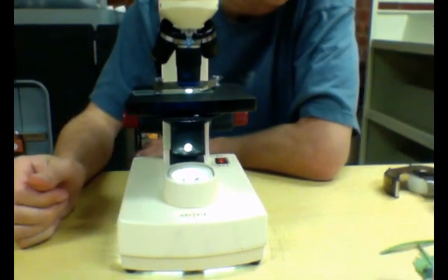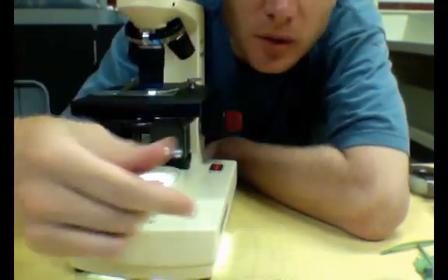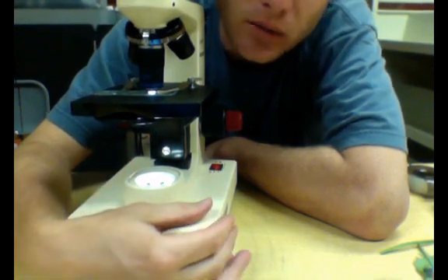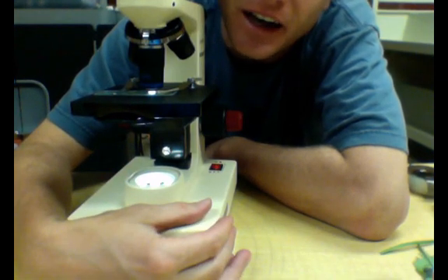And so again what am I looking at? I'm looking at the guard cells. The guard cells are going to be those cells that surround the stomata. They regulate what gets in and what gets out. And I hope that's helpful.